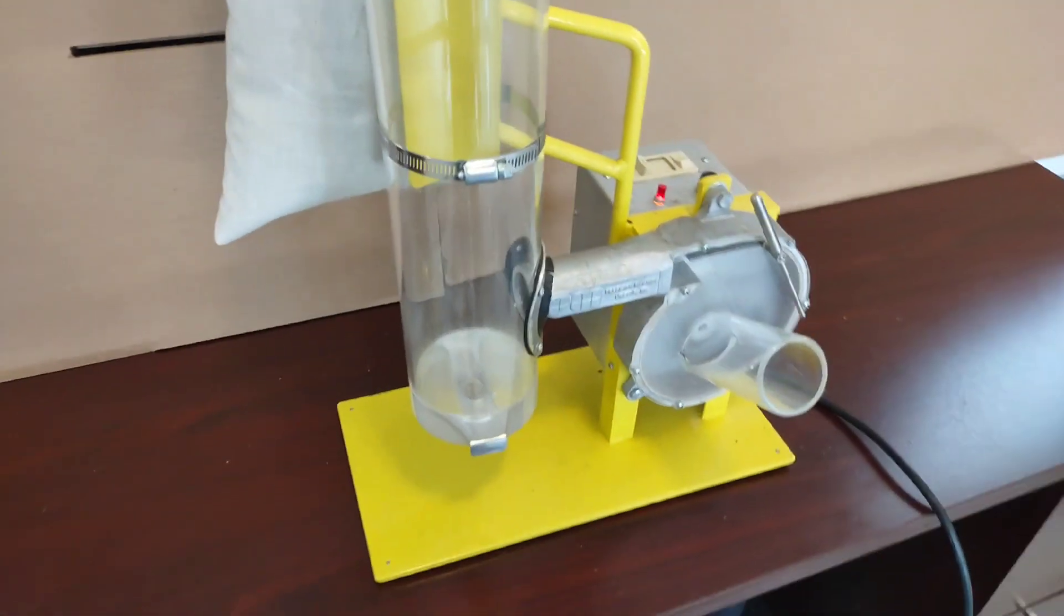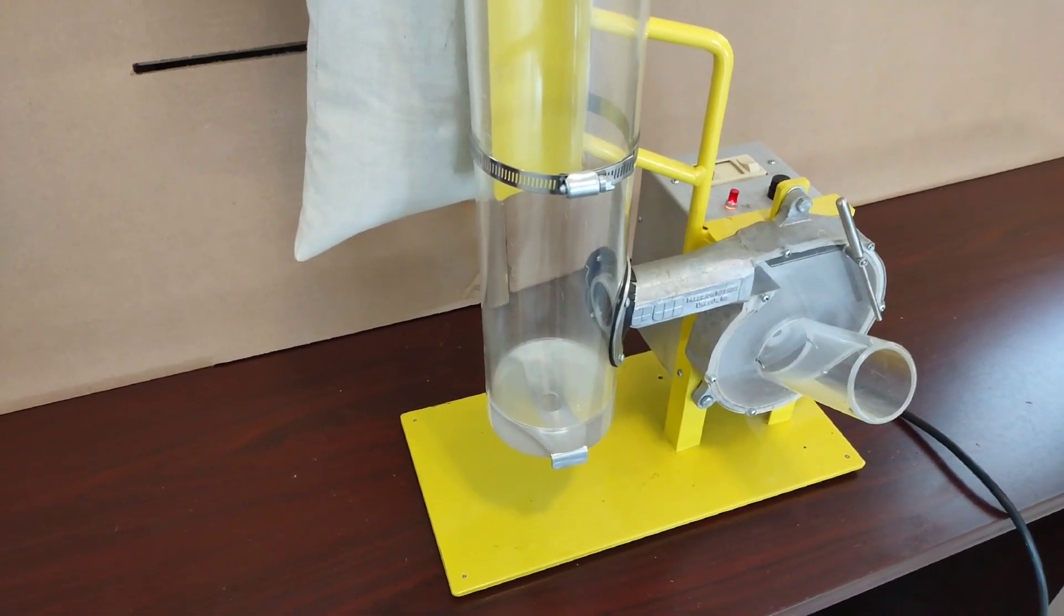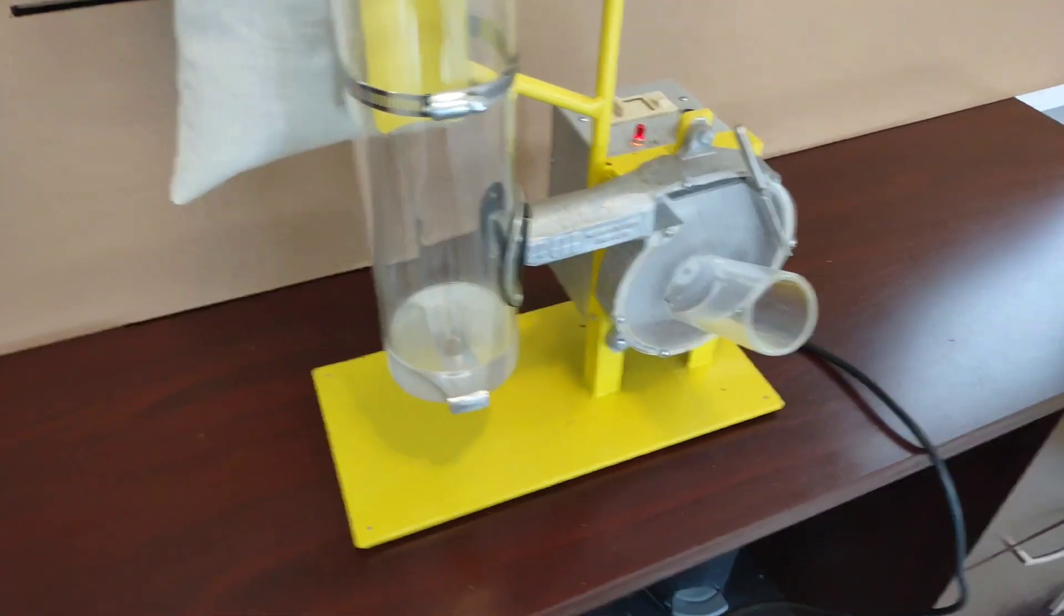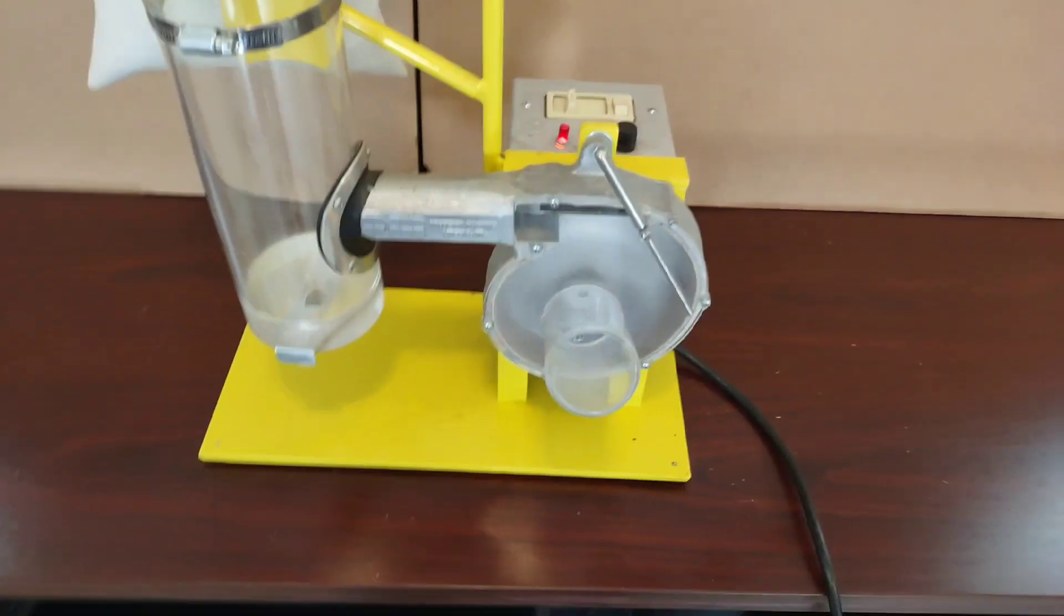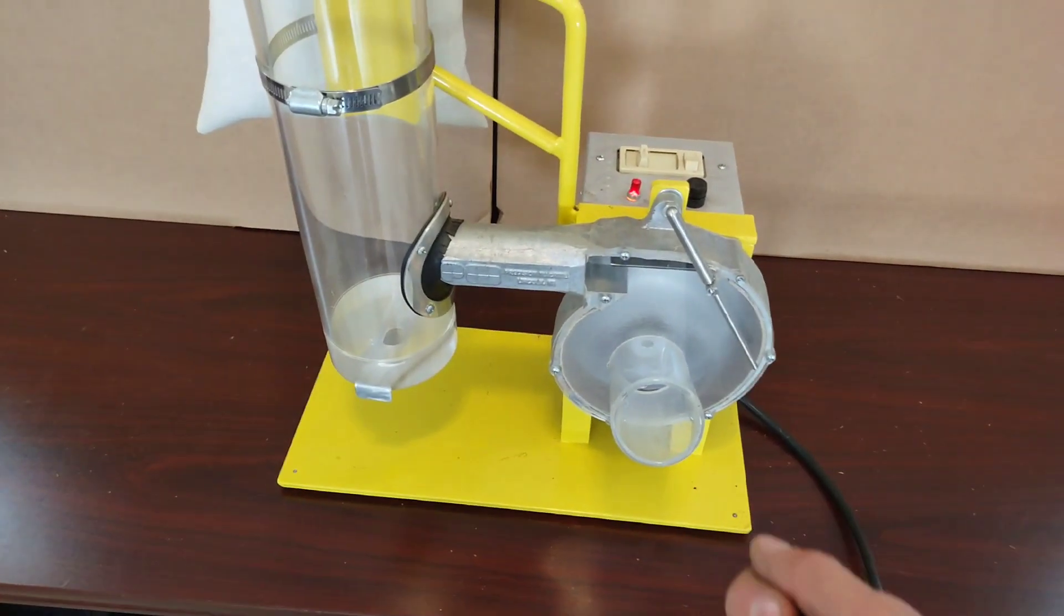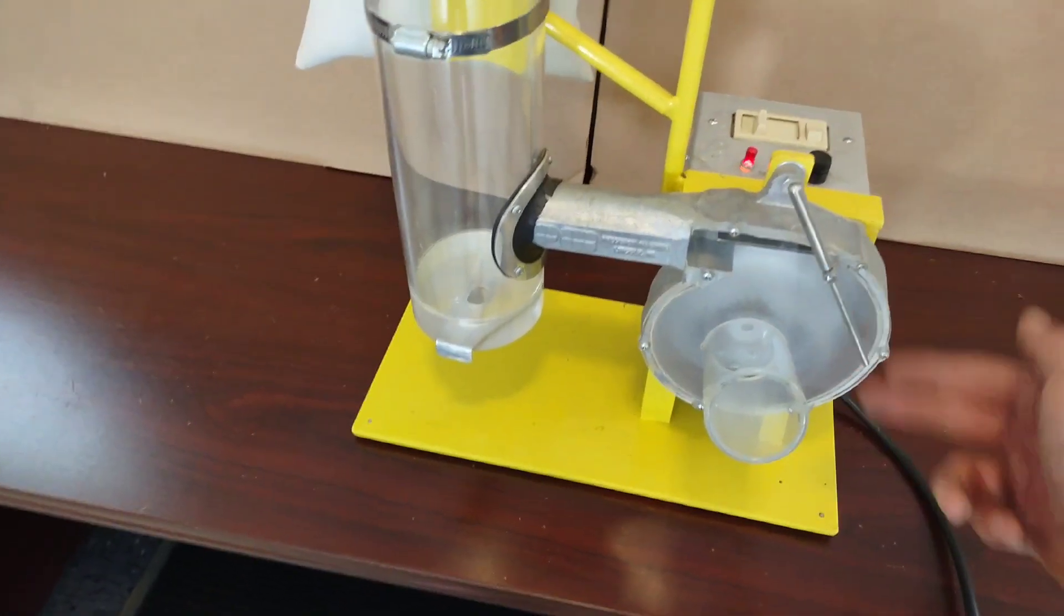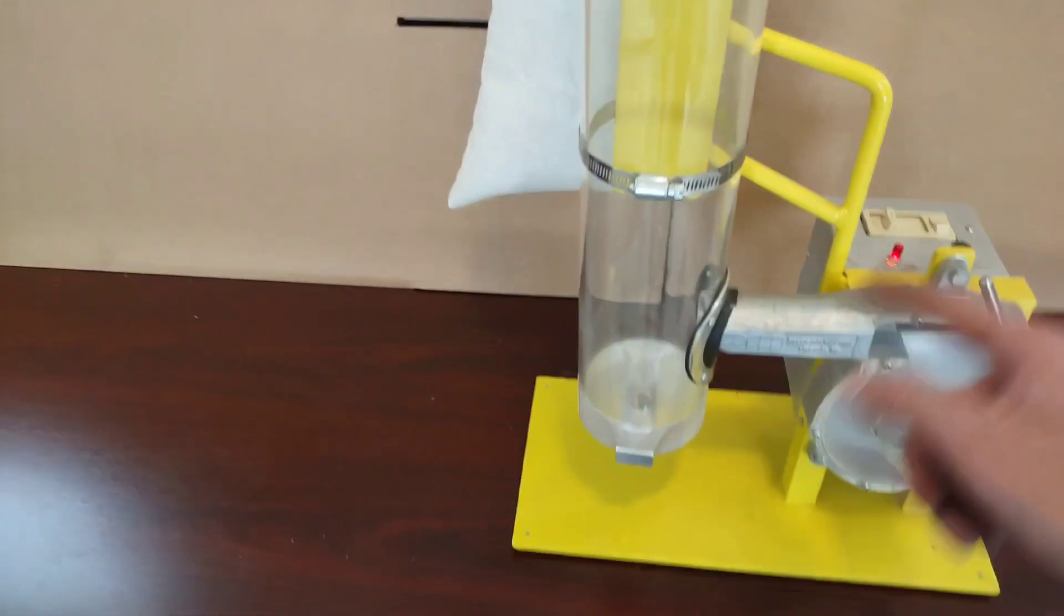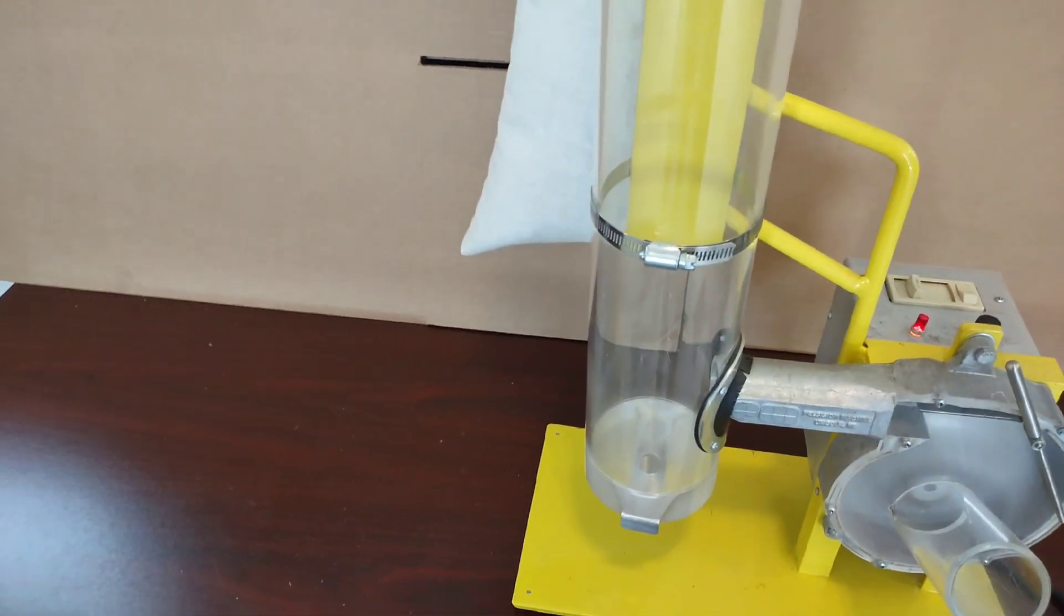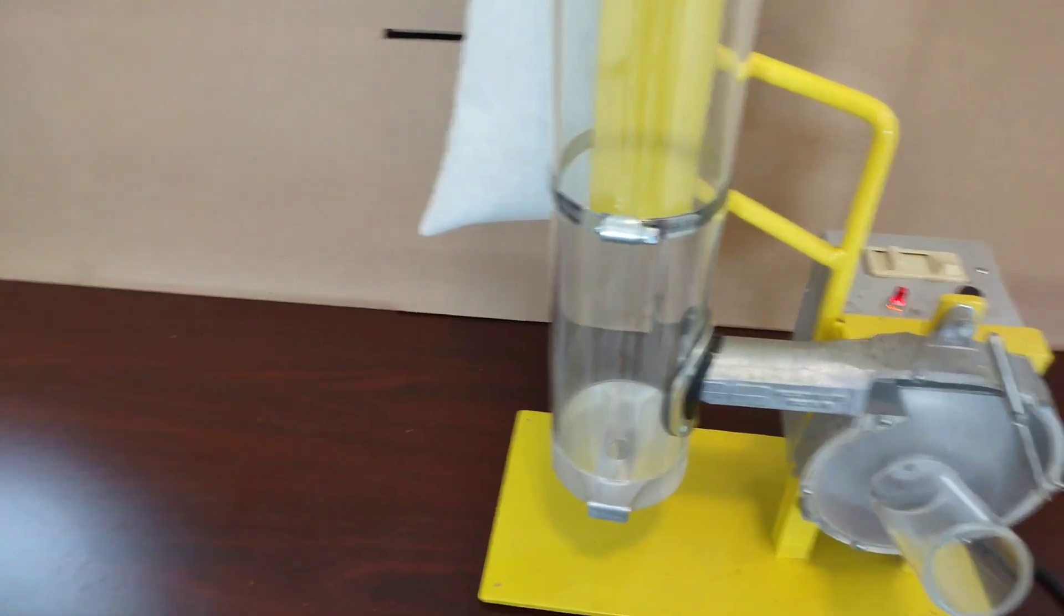The unit runs on 115-volt single-phase power. You would feed your heads of wheat or other grains right into this spout here. They would be sucked in and threshed, then blown into the tube, with the light chaff going into the bag and the seeds staying at the bottom.